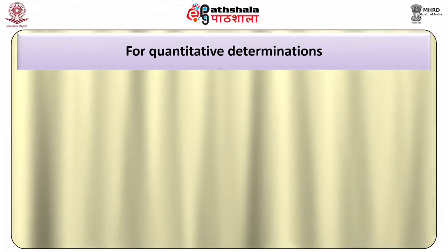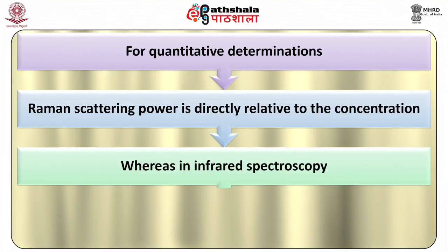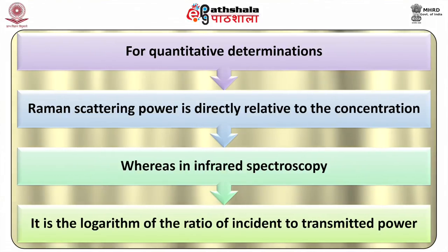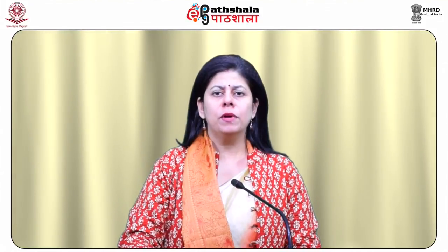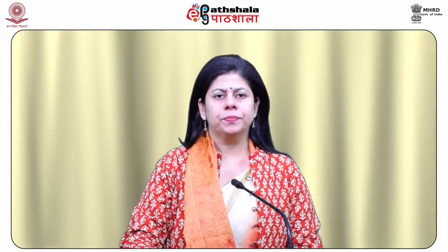For quantitative determinations, the Raman scattering power is directly related to the concentration, whereas in infrared spectroscopy, it is the logarithm of the ratio of incident to transmitted power, that is, the absorbance, that is related to concentration. Finally, sample preparation for Raman spectroscopy is generally simpler than that for infrared.